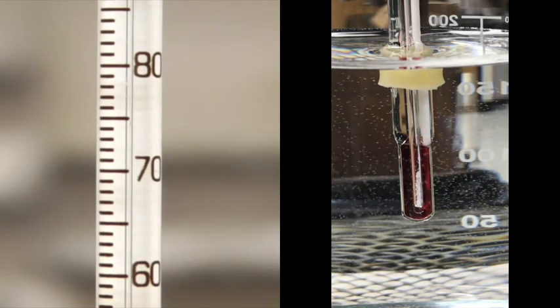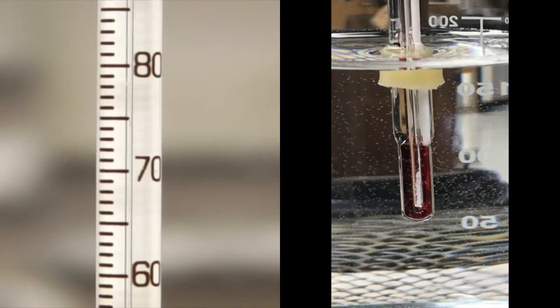That first range was kind of big, so this time we want to narrow that range, get a smaller range, so we get a better idea of exactly where it melts.